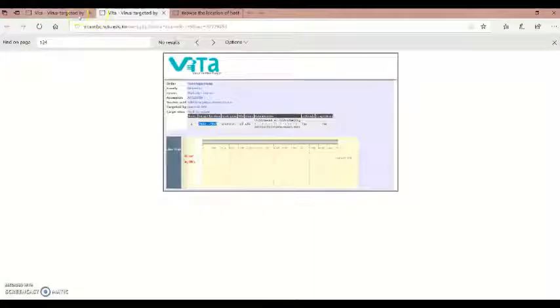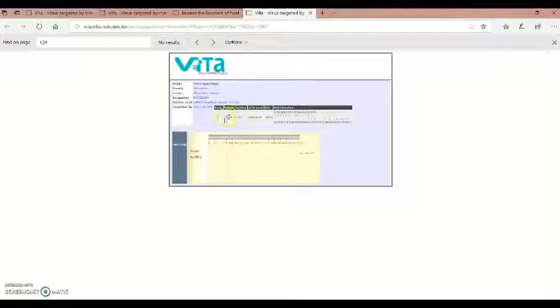So as noted again, in animal sequences there is nearly no alignment for the target of interest, or a very low alignment percentage, as earlier noted between the plant and the animal kingdom. And if we press TargetScan, we can get a closer look at the predicted area for TargetScan. It often is only 7 to 8 base pairs long, where we can get some hybridization information.